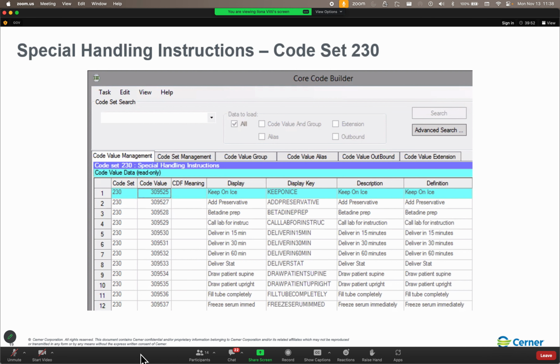So folks, we see this with power plans. We see this with a bunch of orders when they cross an orders interface. So you will get a ticket that says, hey, this should have netted to the same accession number, and it didn't. Well, from the activity that we did this morning, we know that as long as they're not all placed as collected, then we can use collections resolution to merge those orders into the same accession number, into the same container. So that is a way that we can go ahead and resolve that.